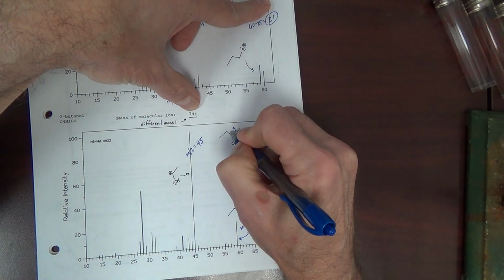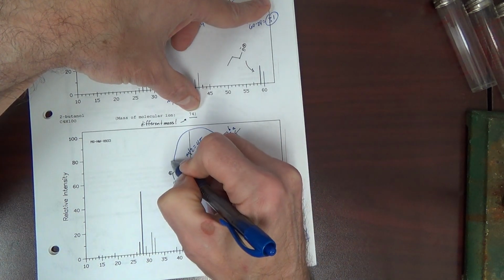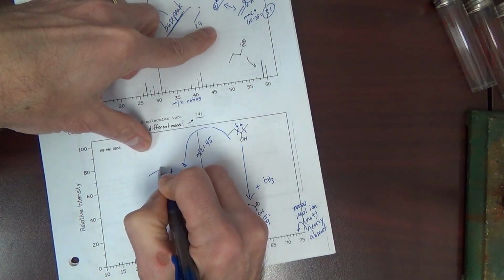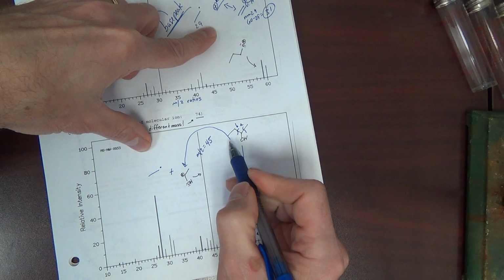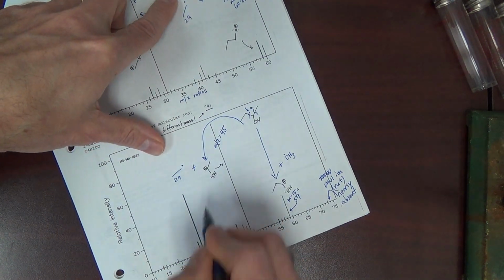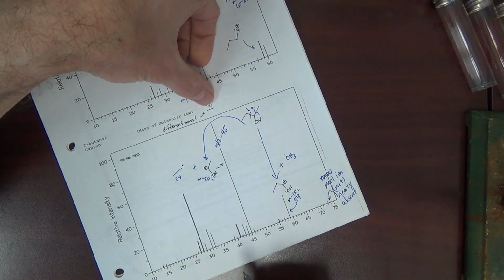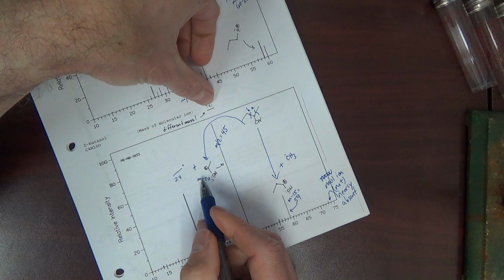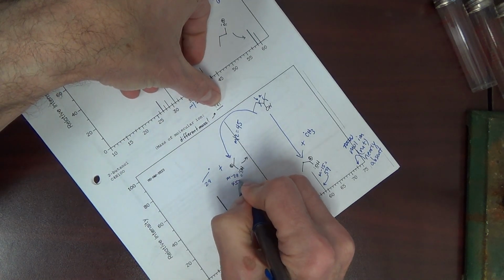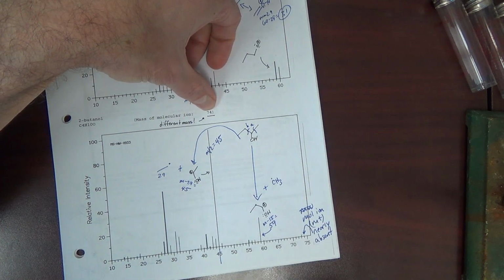But we can also do an alpha cleavage on the other side, call that B. That would give this plus an ethyl radical. We cleaved off the ethyl. That's 29. So M minus 29, 74 minus 30 would be 44. Add 1 would be 45. And indeed, we have a peak at 45.